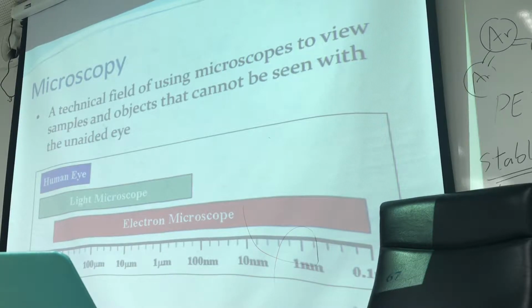The simple detector can give you the picture, which looks more like a 3-dimensional picture. And if you are rich, you can get another detector that can detect X-ray. When you detect X-ray, you can know the composition. You can know what material it is, okay?